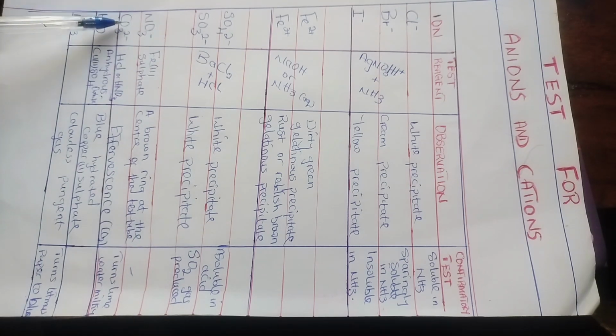The test for the carbonates: you add either hydrochloric acid or nitric acid. Effervescence will be produced. We can liken it to when you put an effervescent tablet in water, and the effervescence produces a gas called carbon dioxide. Further test, how can we test for carbon dioxide? Carbon dioxide is the only gas that turns lime water milky.